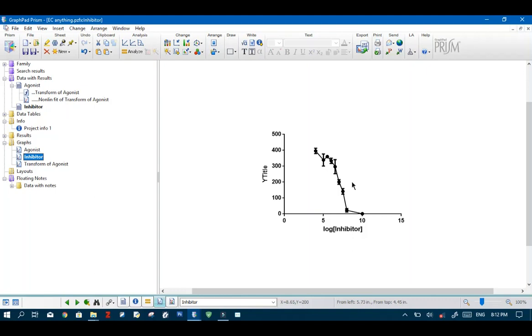So for instance if I want to find IC 25 I will do 100 minus 25 and enter an F value of 75.